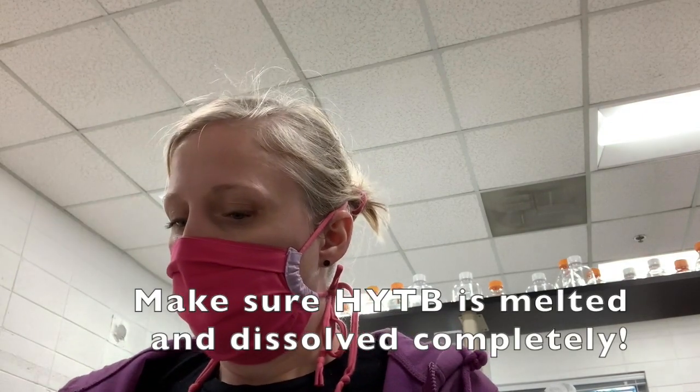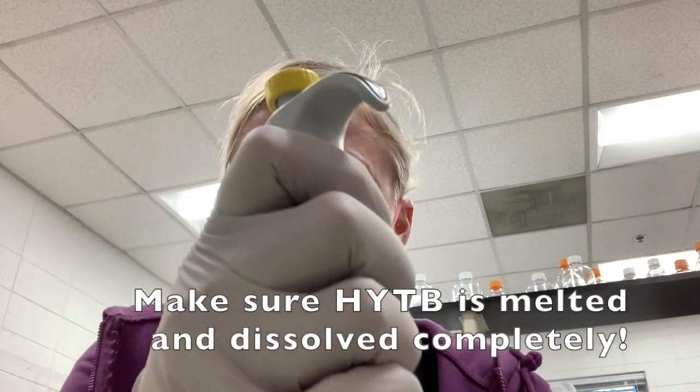So I'm going to put the high yield transcription buffer. Of course, the volumes will depend on how many reactions you have, so make sure your math is correct. So I added the high yield transcription buffer. I'm going to add the rNTPs.